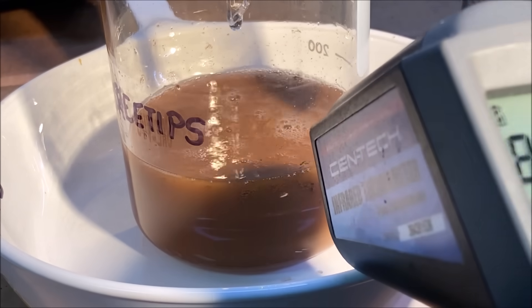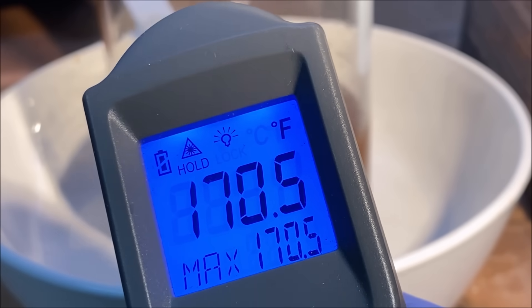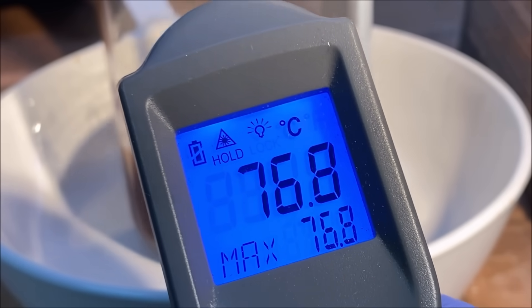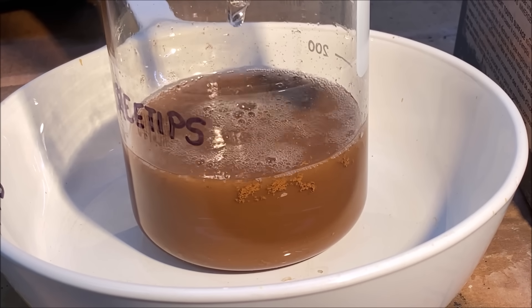I can tell by how it's looking right now that all the gold has come down. We've got 170 Fahrenheit — 76.8 Celsius — and that solution heated up quite a bit from that reaction.